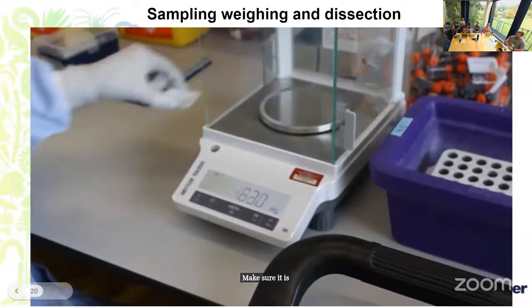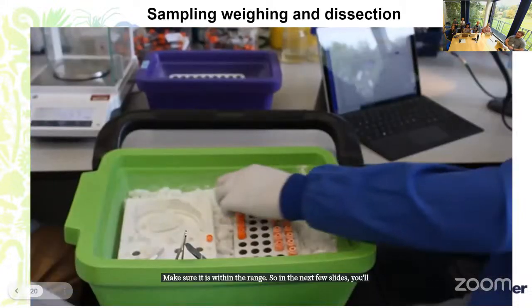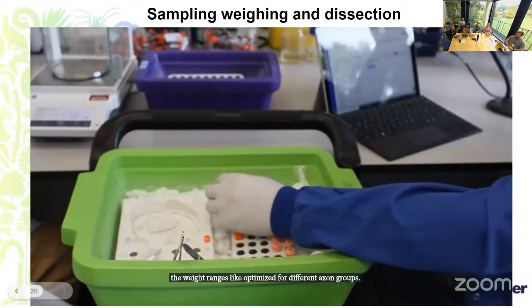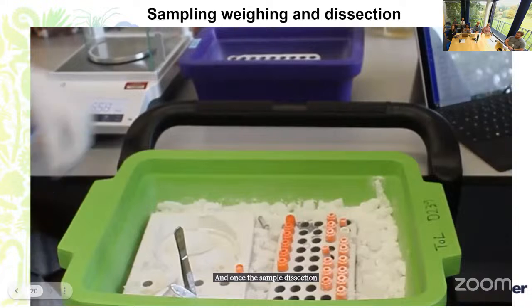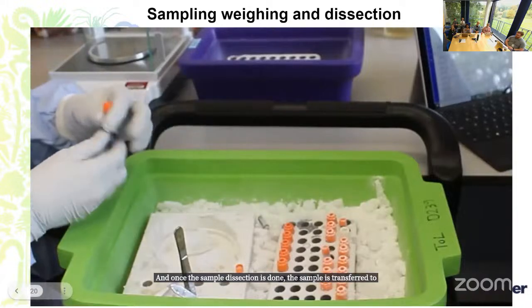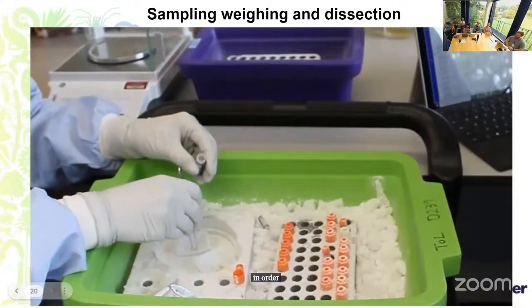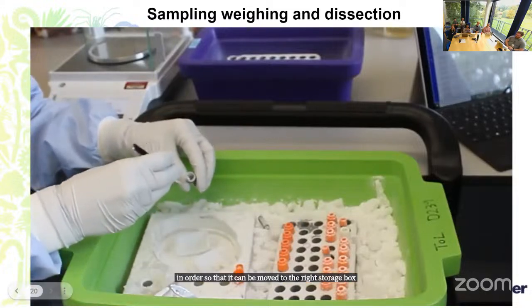In the next few slides, you'll see how the weight range is optimized for different taxon groups. And once the sample dissection is done, the sample is transferred to a new FluidX tube and placed in an order so that it can be moved to the right storage box and picked up for the downstream processes.